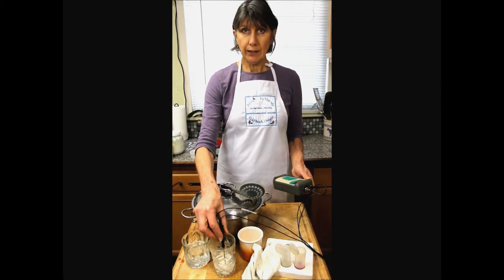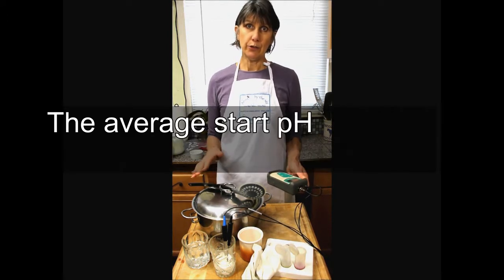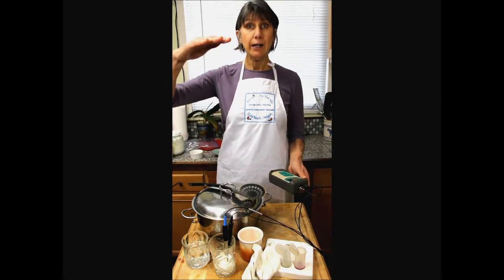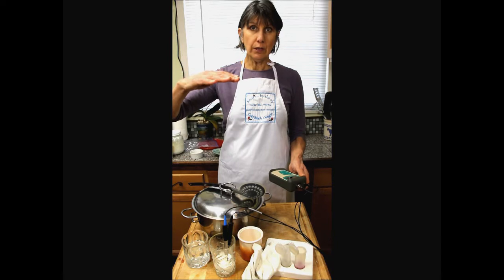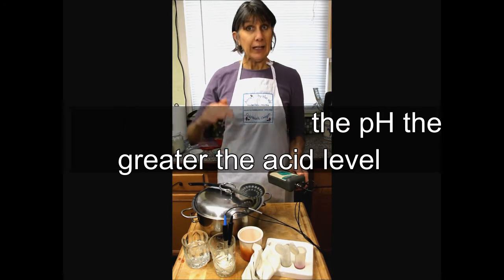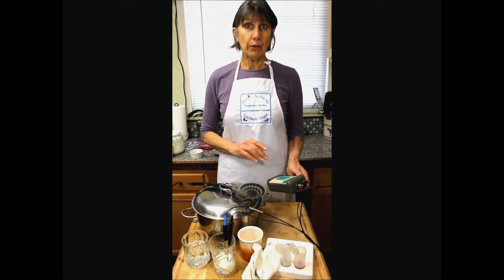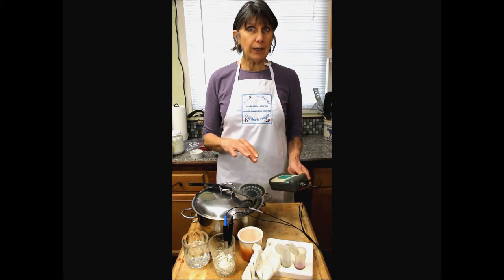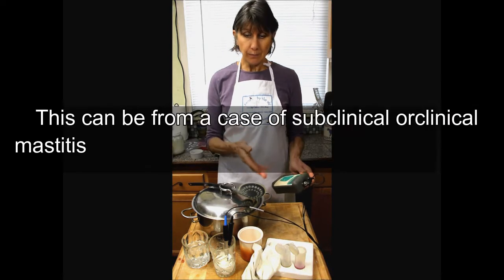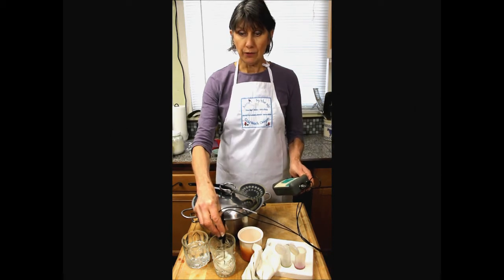Milk varies greatly in what its pH reads for you, depending on temperature. So does cheese. Typically, the colder the milk is, the higher the pH. 7 is neutral. Milk normally is just below 7, so it's slightly acidic. If the milk is alkaline above 7, it's likely that there's a problem with the milk. Specifically, white blood cells that are in the milk to fight an infection in the udder. So this milk is reading 6.65 at refrigeration temperatures.